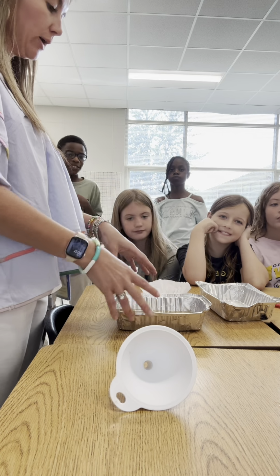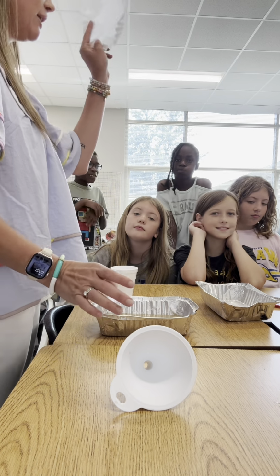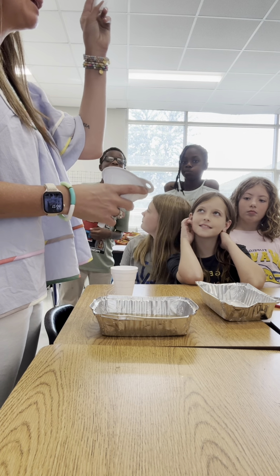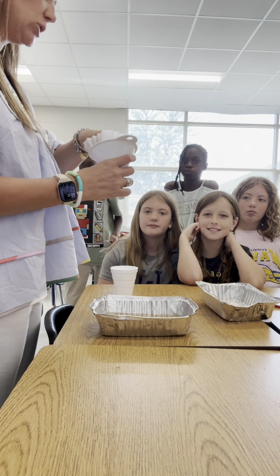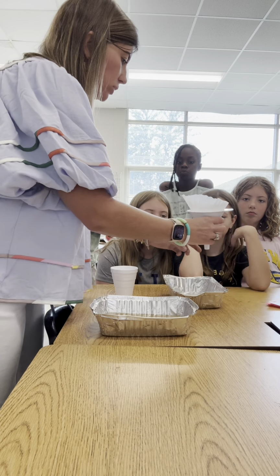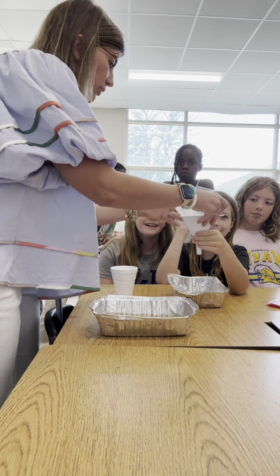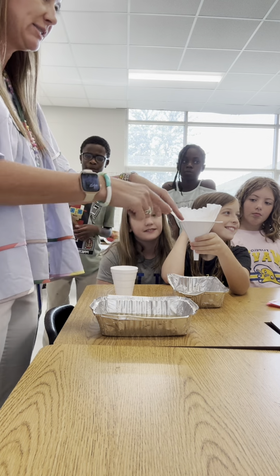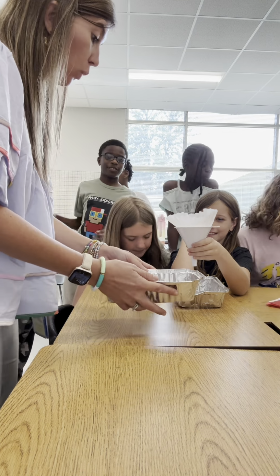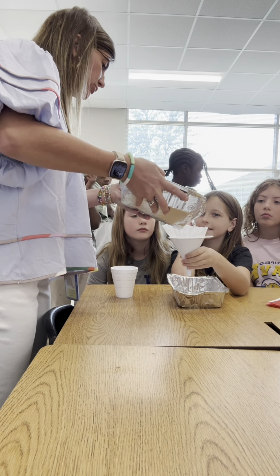All right, so in order to separate this water and sand mixture, I have to use a filter. You cannot see the holes in it, but there are teeny tiny holes that allow the liquid to go through them. So I'm going to put the filter on top of the funnel. And Harper, will you hold this? Just hold the funnel. Right there. All right, and so I'm going to pour the sand and the water into the funnel. And the water should be the only thing that goes through.